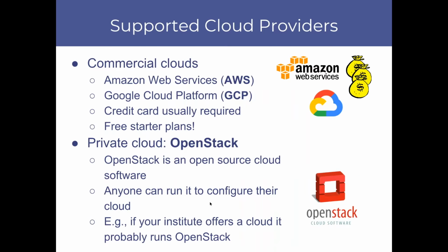Now, PhenoMeNal supports a number of cloud providers. Some of these are commercial. We support Amazon Web Services, Google Cloud Platform. For these, a credit card is usually required unless your institution has some kind of institutional account. But if you want to just start playing with them and seeing what it is to work on the cloud, they do have some free starter plans you can take advantage of. We also support private clouds in the form of OpenStack. OpenStack is an open source cloud software, which means that anyone can use it to configure their own cloud at their own institution, for instance. So in fact, if your institute provides a cloud, it very likely is running OpenStack software.